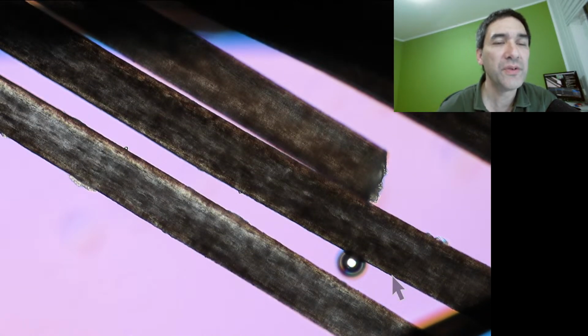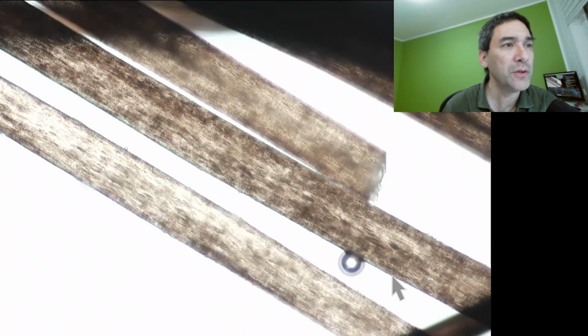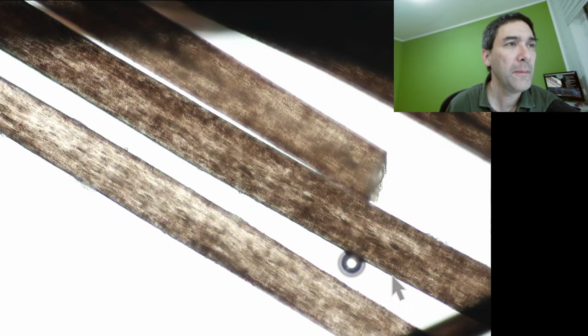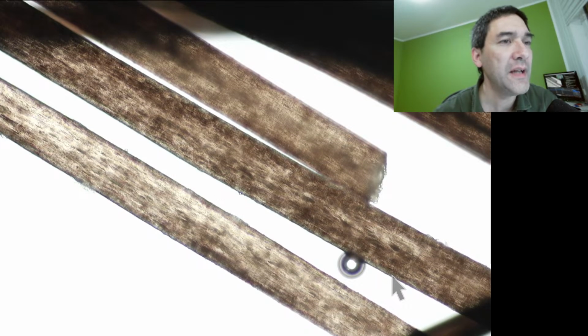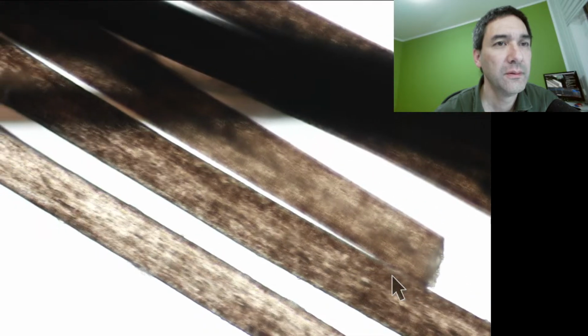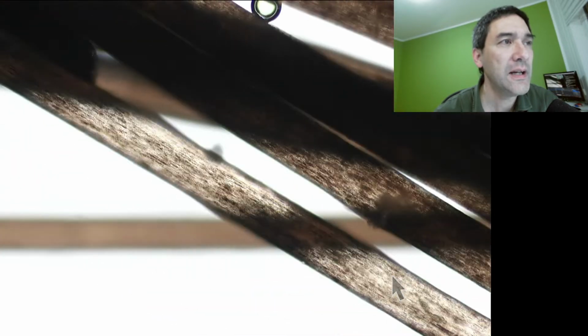Do we use a polarization condenser? Yes. Not now, this one not. Okay, now I moved it away. So this is now the natural look. It's basically not the natural color before.